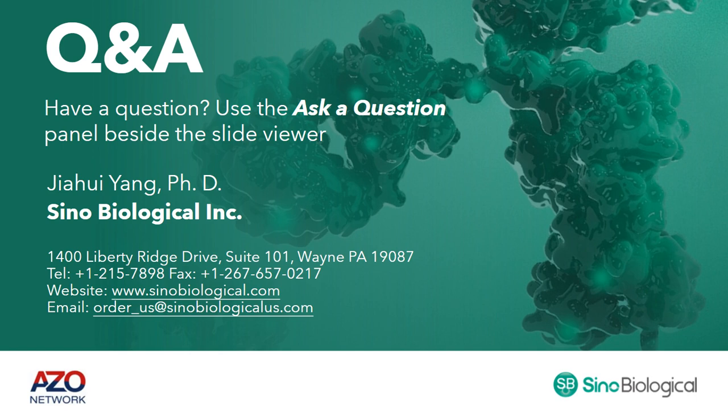But if we only get a few positive clones from a regular size antibody library, we will first confirm the quality of the library and also the quality of the antigens and the reagents used in the screening processes. If everything is okay, we may try other biopanning methods or change the experimental conditions. For example, switching from solid surface biopanning to in-solution biopanning, or coating screening antigens at a different pH level, which may help to expose other epitopes of the antigen and may improve the number of positive clones.